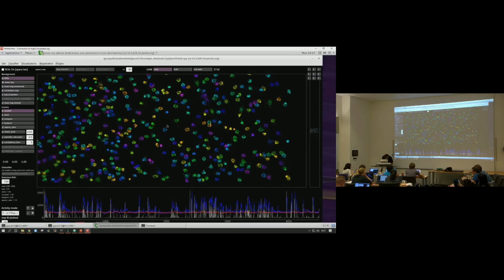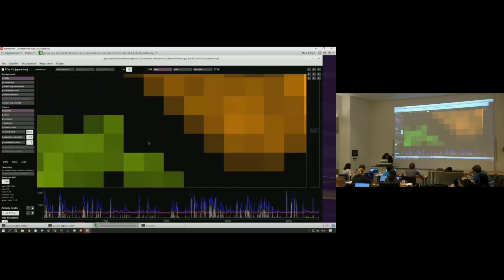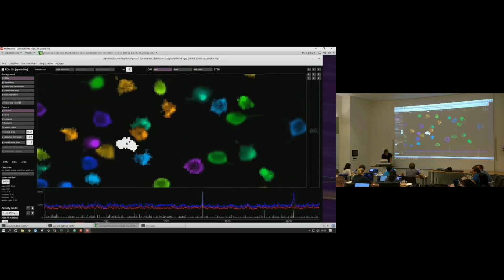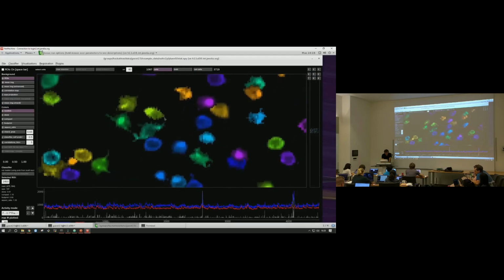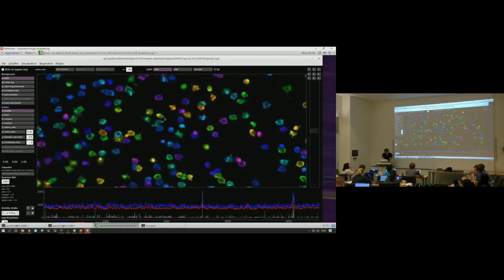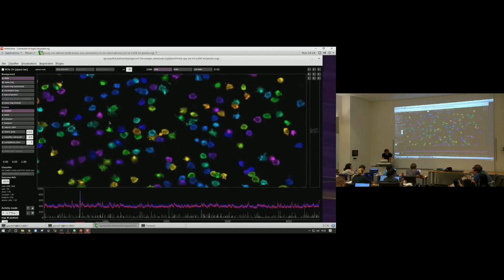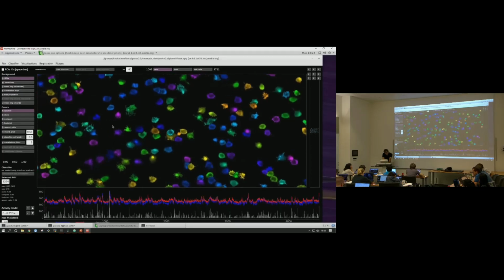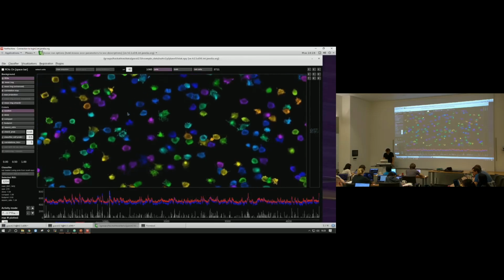Okay, so you might go through, find other things. Oops. I don't know, what's that? Let's put that away, etc. You may want to do this carefully for the first few data sets because you're going to use that as training data for the classifier. So you might want to spend a good amount of time. If you just started the project and these are the first data sets with this particular type of recording, you'll be doing this anyway. So you're manually refining. Okay, so you got to a point where you're pretty happy about it.